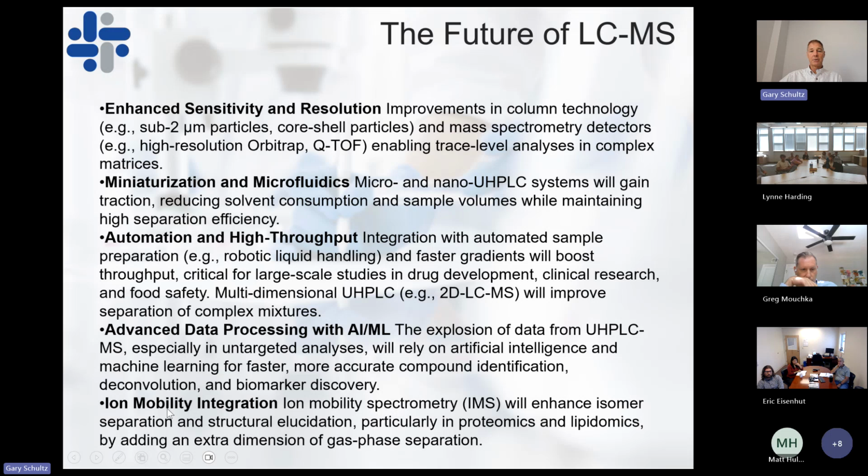One thing I didn't mention, but it's also an emerging component of the mass spectrometer, is this methodology of ion mobility. Within the mass spectrometer itself, it adds an orthogonal means of separation based on isomeric differences, so the different isomers are able to separate based on the ion's interaction within a low pressure, moderate pressure region within the mass spectrometer.